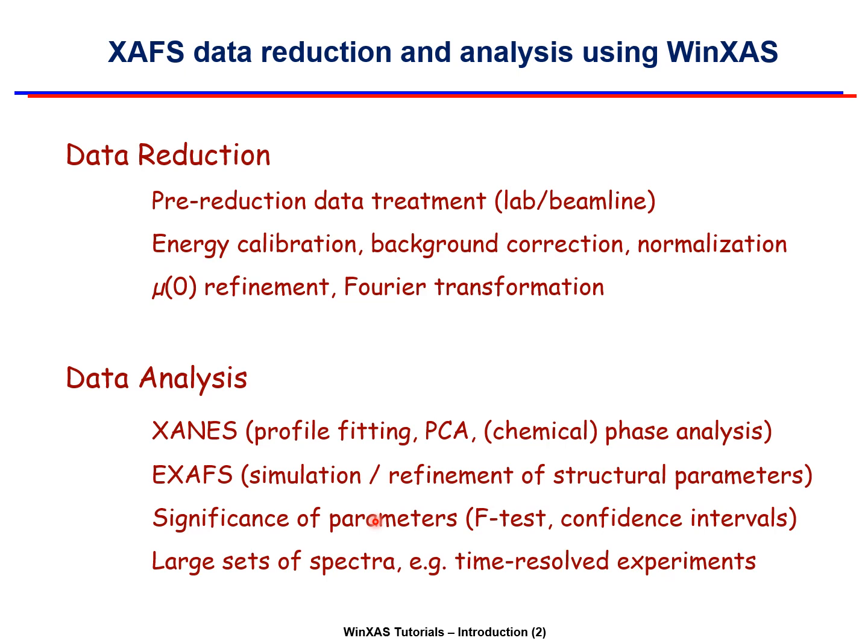And eventually I will be showing how to use all these procedures in the analysis of larger sets of spectra like those obtained from time-resolved experiments.